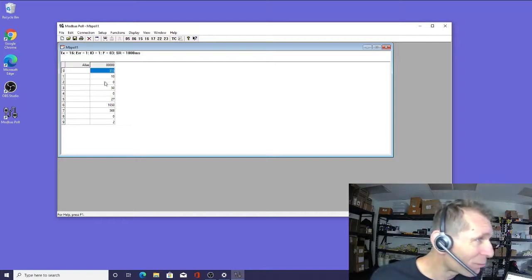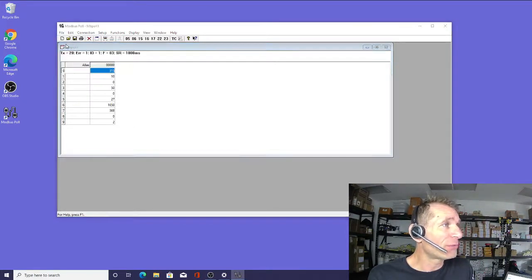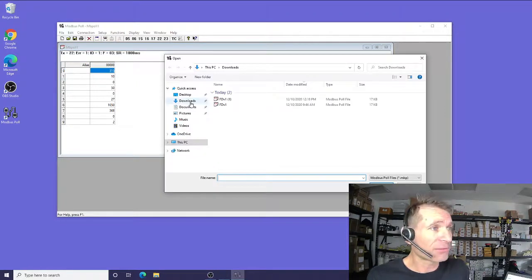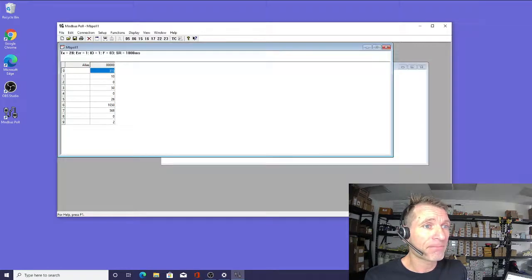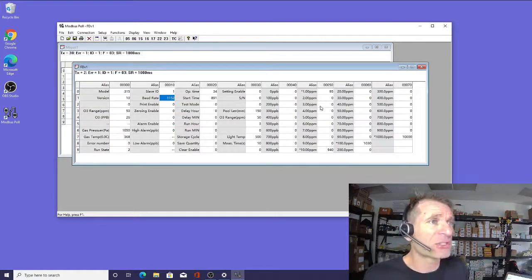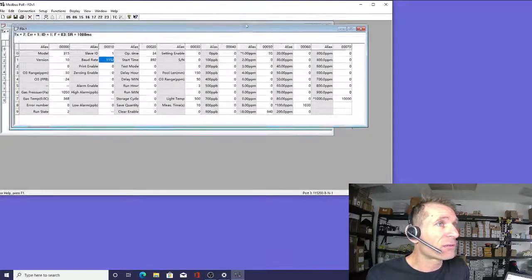What is this? What are these values? So what you have to do is you have to open the MBP file, folks. The one that you just downloaded is the FD-UVO3 MBP file. Click on that, and that will sort of arrange the information in a much more digestible fashion, okay? So let's just move the window across.